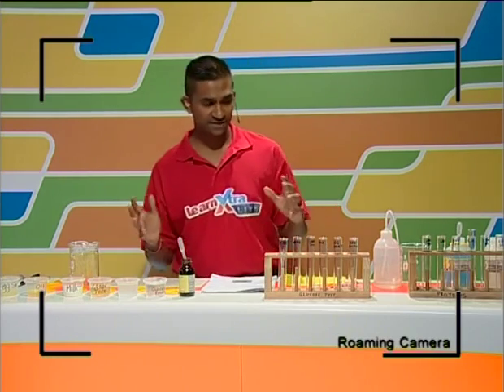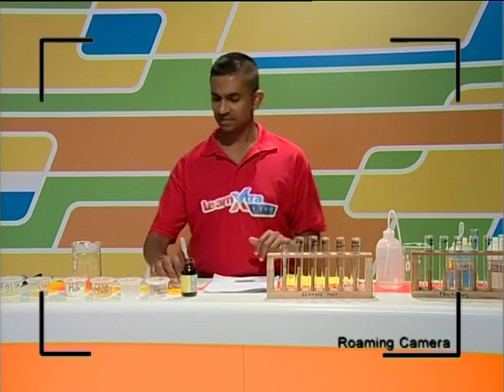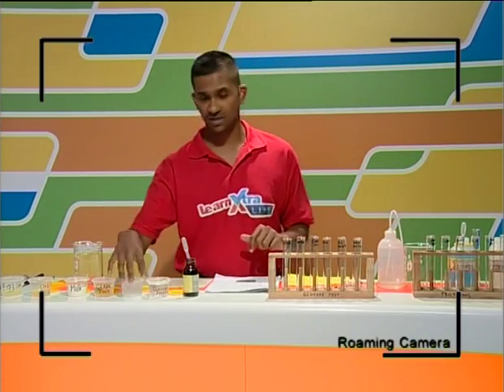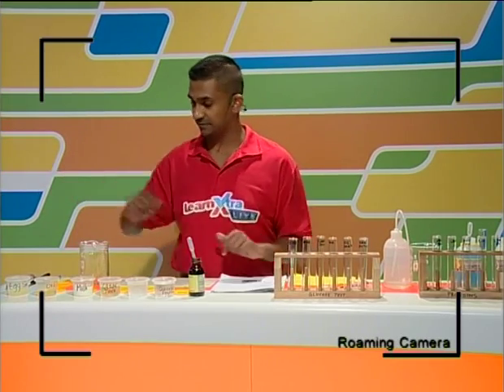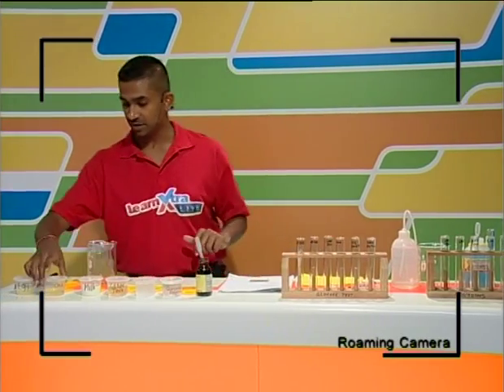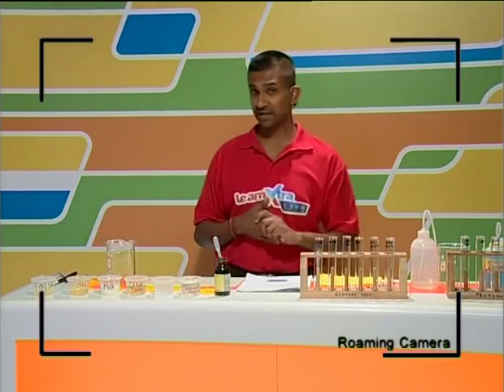So what I've set out in front of me today are different food samples that I've prepared. Here you see there's a glucose sample. Here we've got a starch solution. I've got some grape juice in here. We've got the milk that we normally have with our coffee and tea, and here I've got an oil sample that we use at home for cooking, and here I have an egg solution, obviously prepared from egg.